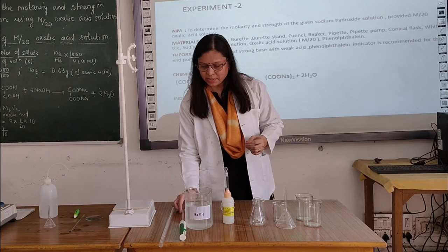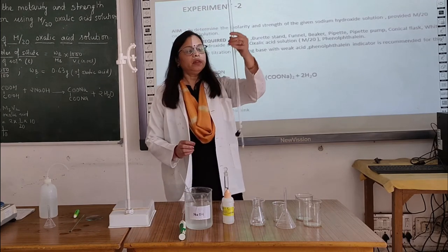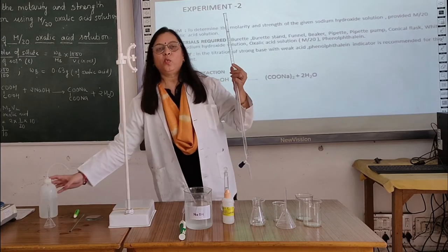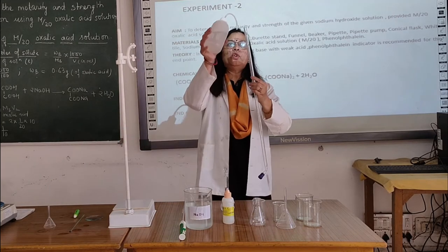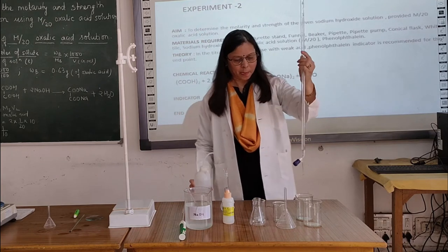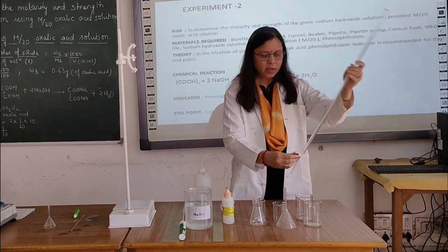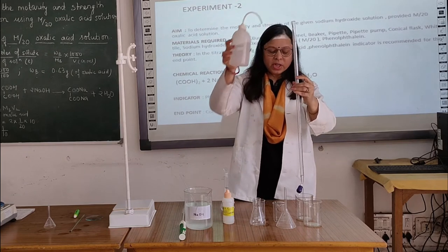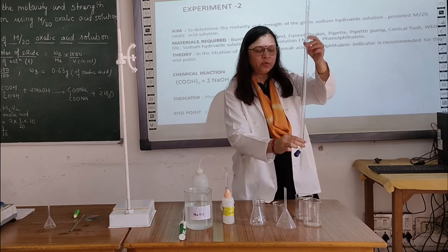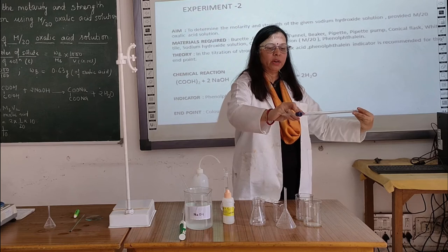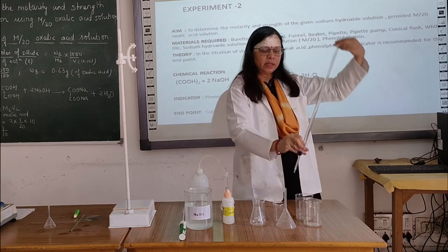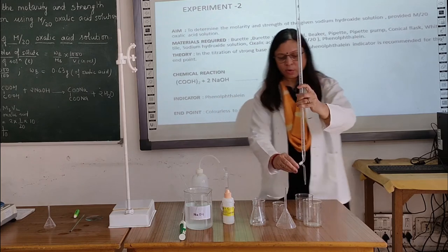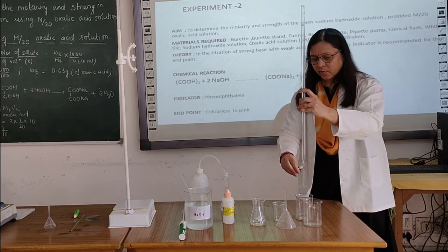First of all, all the apparatus should be thoroughly washed with distilled water. Let us wash the burette — these are already washed but I am showing again how to wash and rinse it. Adding a small amount of water and shaking it thoroughly throughout the burette so that all impurities are washed away. This is the stopcock — open this stopcock and drain out the washes.